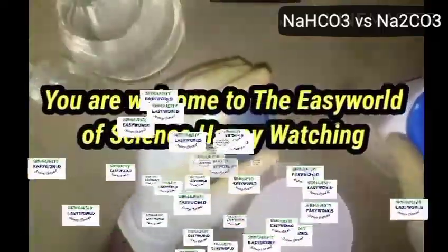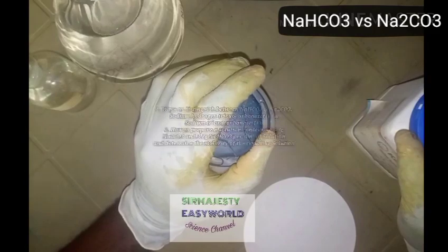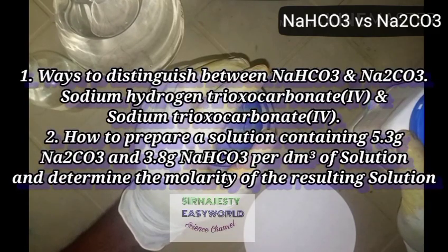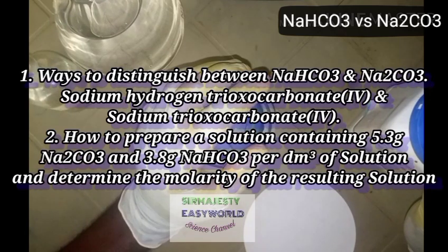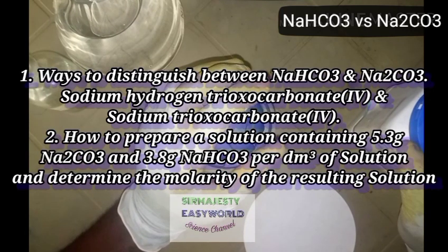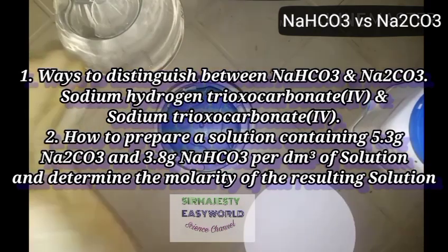Today, I'm going to demonstrate for teachers two things here: how to distinguish between sodium trioxocarbonate(IV) and sodium bicarbonate, that's sodium hydrogen trioxocarbonate(IV), and also how to prepare the two standard solutions required for a certain titration, where you are asked to prepare a standard solution containing 3.8 grams of sodium hydrogen trioxocarbonate(IV) and 5.3 grams of sodium trioxocarbonate(IV).